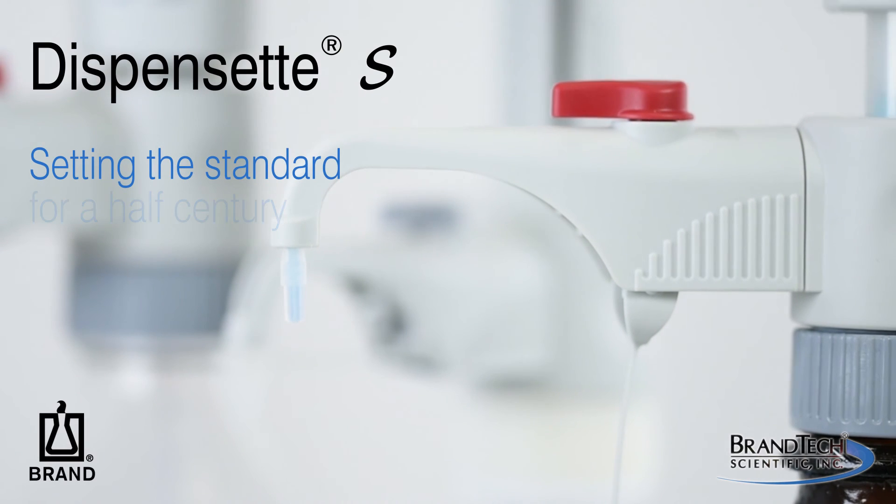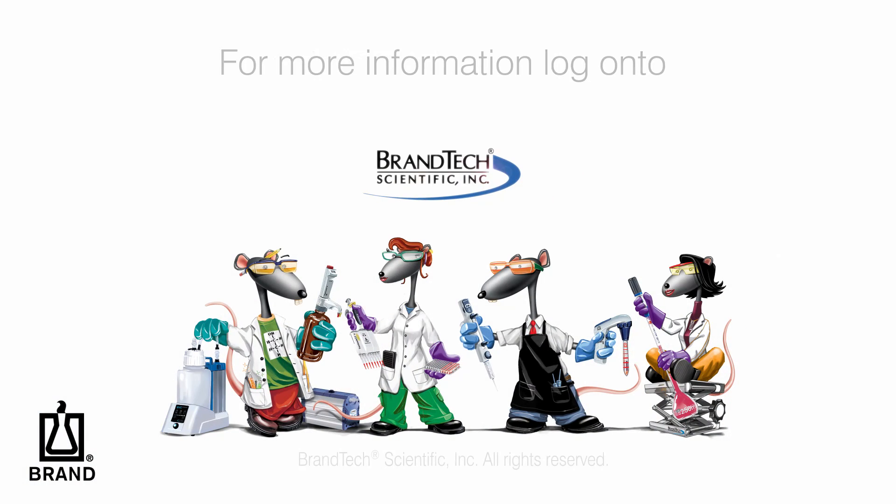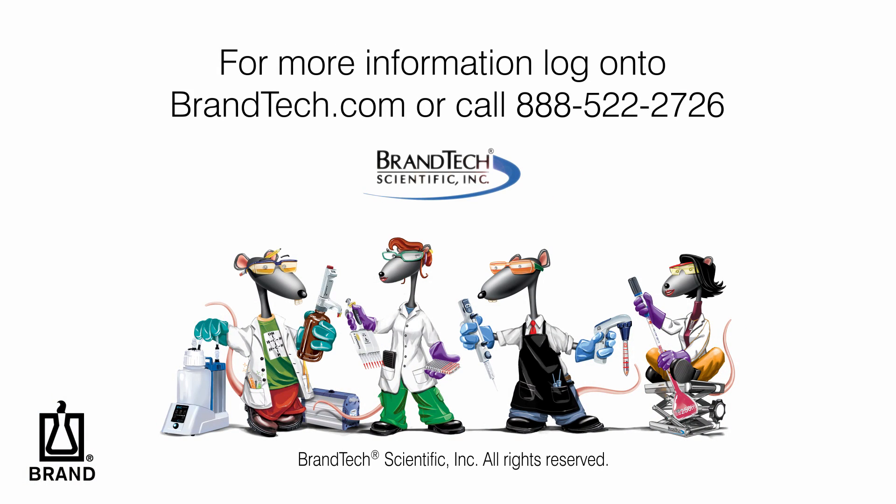The new Dispenset S Bottle Top Dispenser — setting the standard for a half century. For more information, visit Brandtech.com.